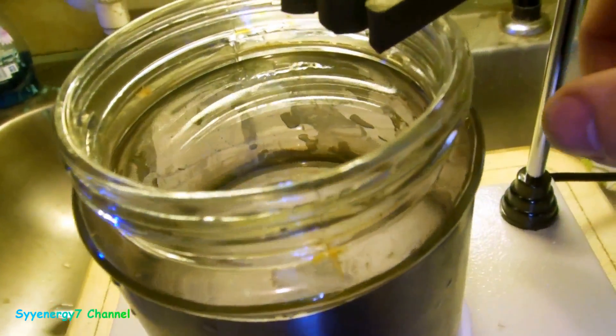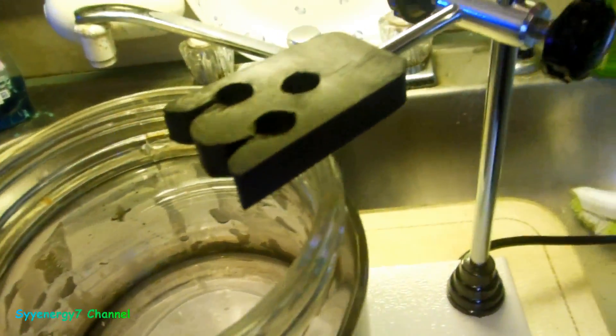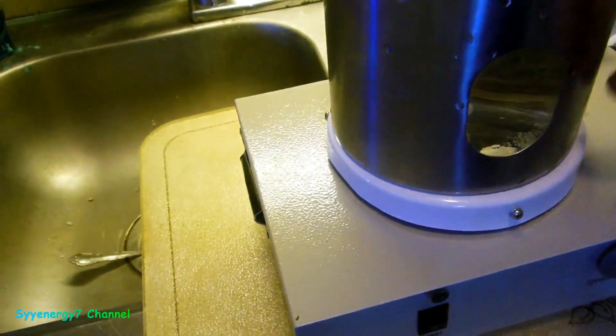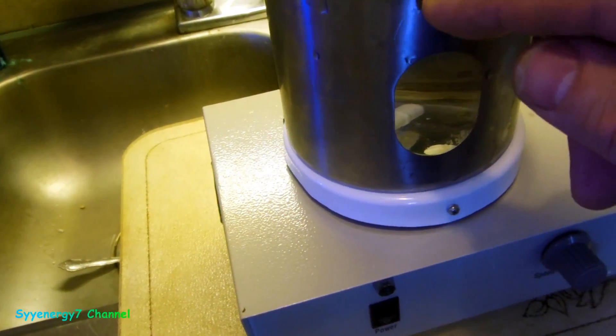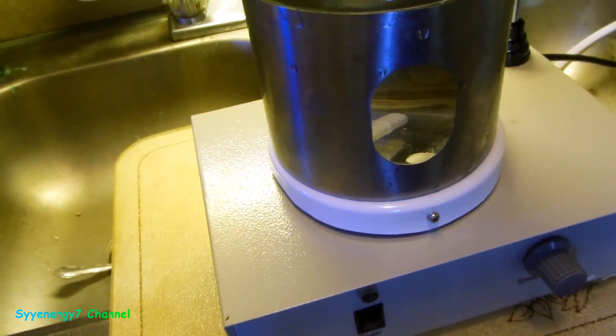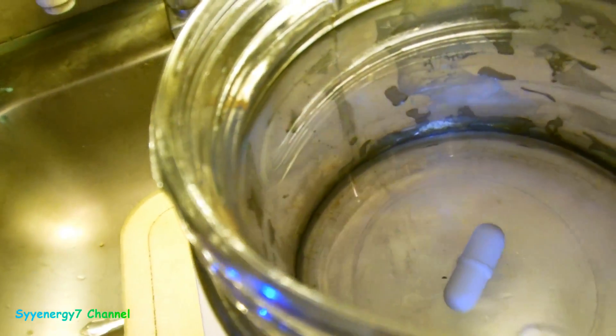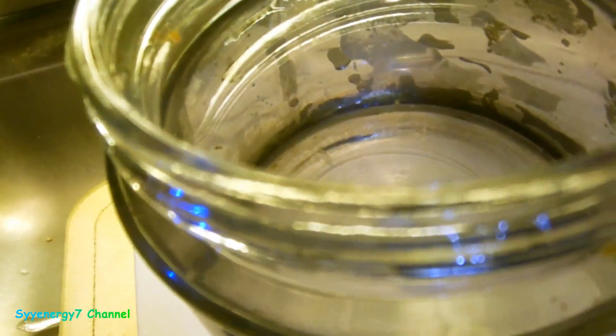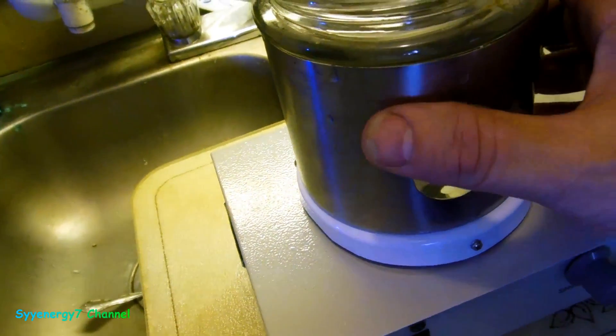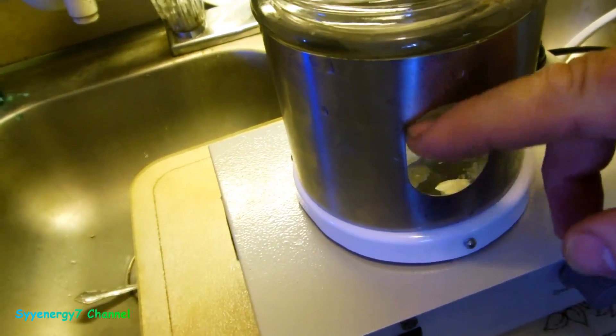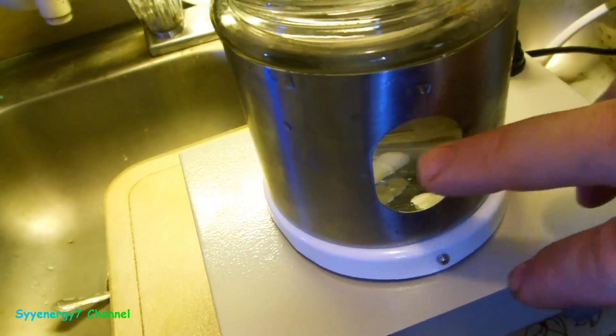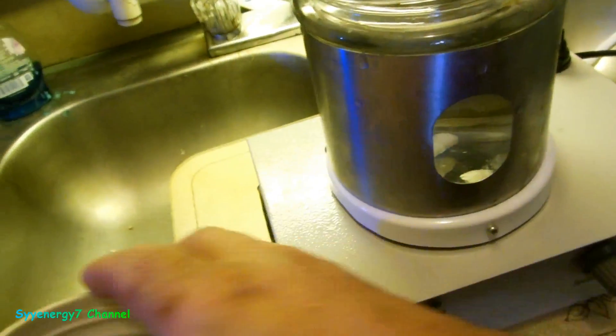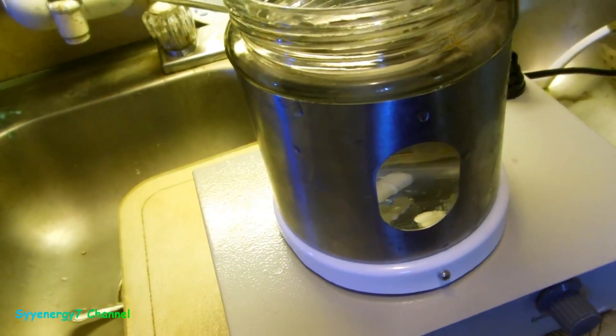That's a good deal and it's got this thing. I think this is how this works - it holds it. It's like rubber here and you can adjust it up and down, left and right, holds your glass in place. What's cool about this thing is one of those Walmart stainless steel sleeves and the bottom is glass, so it's not affecting anything. Stainless steel isn't that magnetic anyway, but the bottom is glass which is cool. So this covers up the light from coming inside, yet I can still see what's going on. You just turn that to the face of the wall when you're making it. After you make the colloidal silver and you got this lid on it, that makes it all impermeable to light.